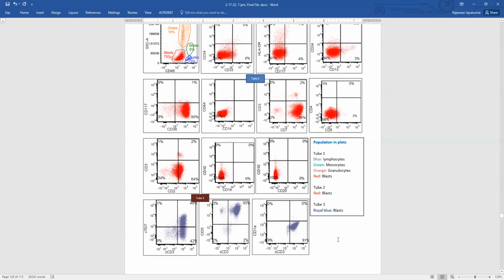Followed by CD7, CD2 and CD5 are the earliest T cell markers acquired. So here CD5 and CD2 are positive, cytoplasmic CD3 is positive, and TDT is positive. The earliest precursors in the marrow are positive for CD34, and subcapsular thymocytes are also positive for CD10.